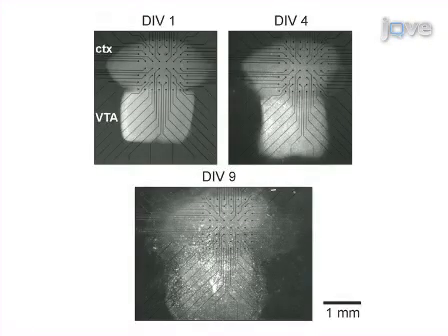During normal growth, the culture will flatten substantially and expand slightly dorsally due to the development of superficial cortical layers. A healthy culture is identified by its opaque, greyish tissue in bright field. Conversely, bright reflective vesicles are characteristic of dead, degenerative cells. About 10 to 12 days after preparing the cultures, they are ready for recording and stimulation.